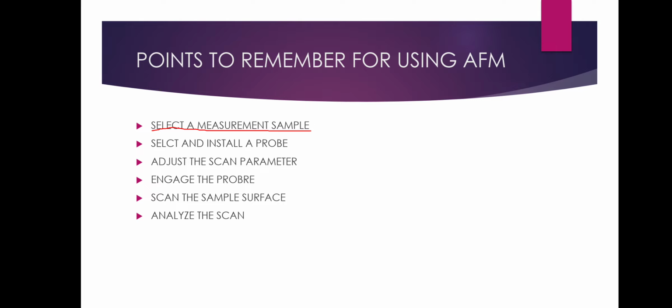Second, select and install a probe. Probes are made of different materials, in terms of their geometry, cantilever and material. So we need to place a suitable probe for the scanning of the sample surface. And we need to adjust the scan parameters.